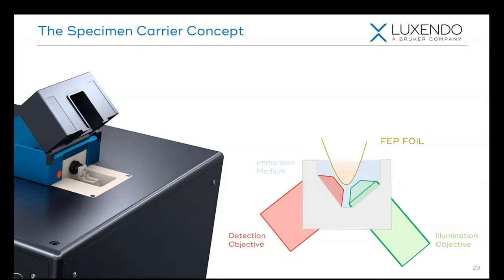This also allows us to fill this chamber with whatever sort of media that your cells want to be in, and either culture your cells in these chambers or physically place them in, and we can line up multiple of these embryos at a time to perform our imaging. And then generate a light sheet with our illumination objective and detect the emission orthogonally with our detection objective.